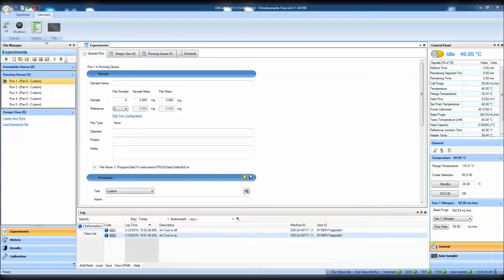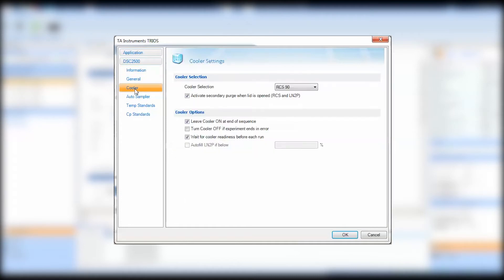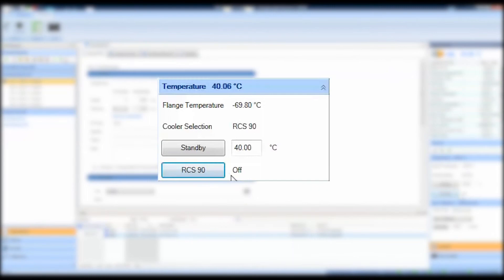Then go to TRIOS. Under Options, under DSC and Cooler, you can select your cooler type for your DSC. Click OK. Before you finally click the event on button in TRIOS, make sure the base purge is connected to your DSC. Then click — your RCS is now operational.